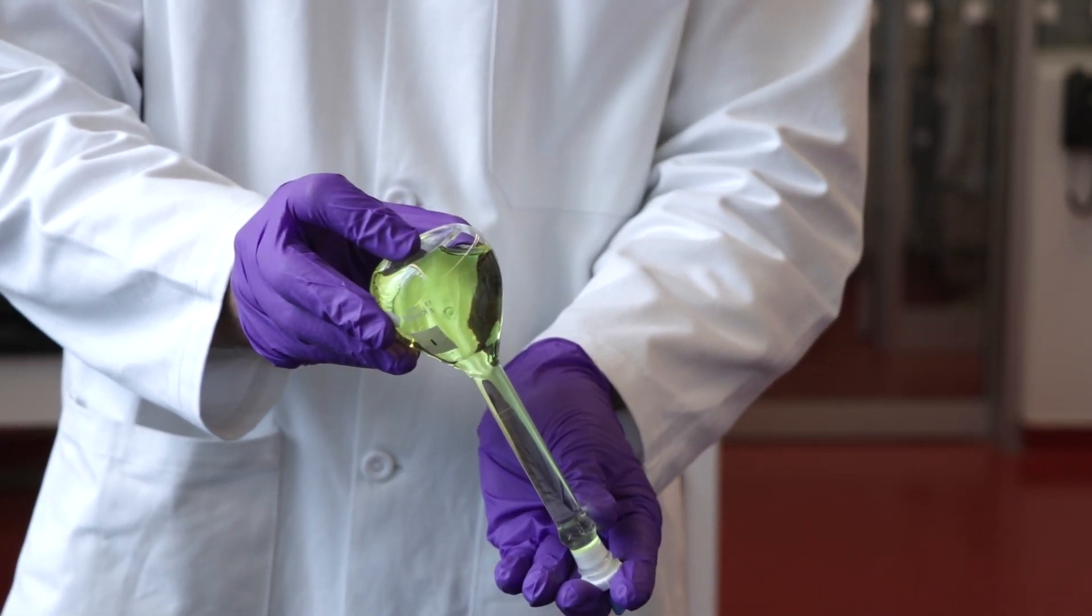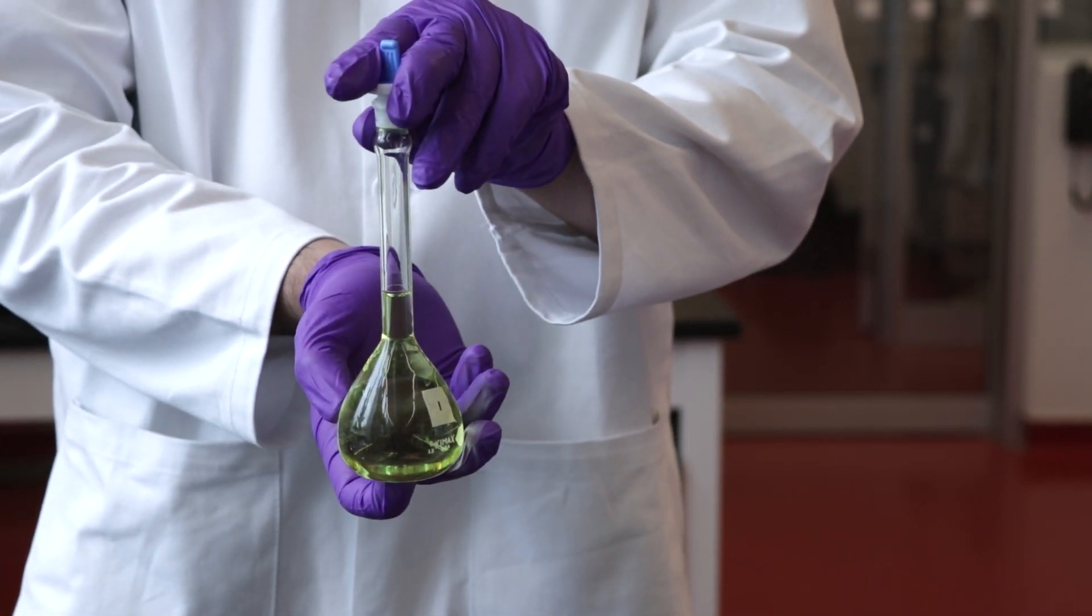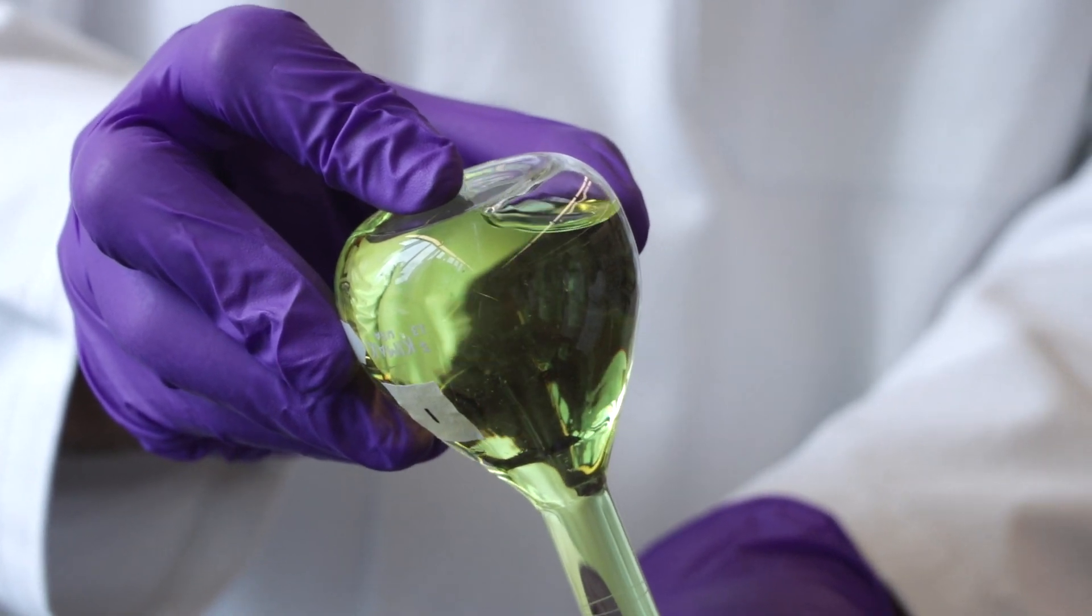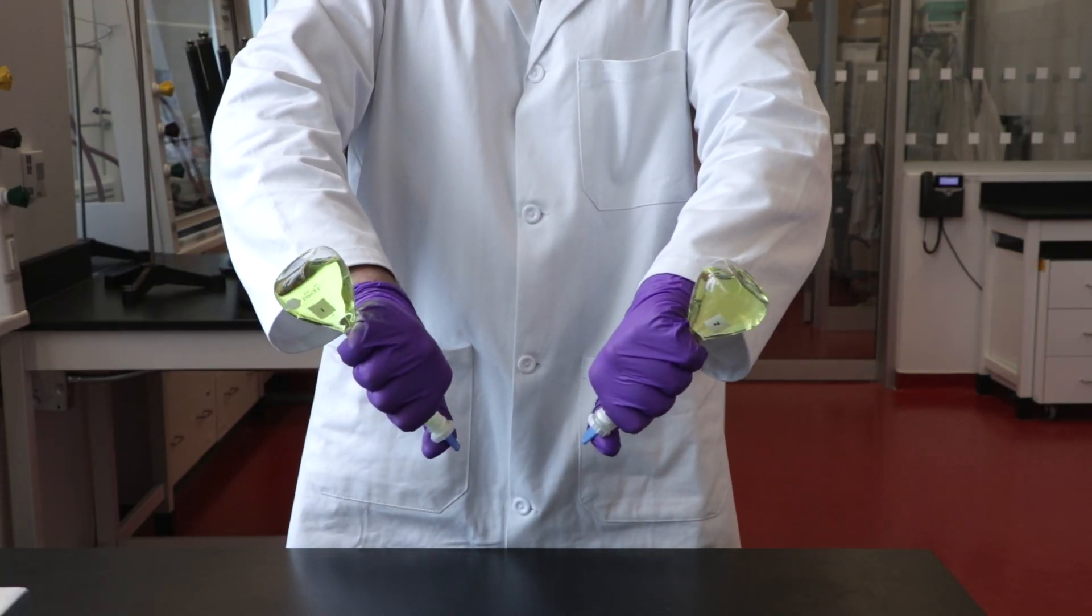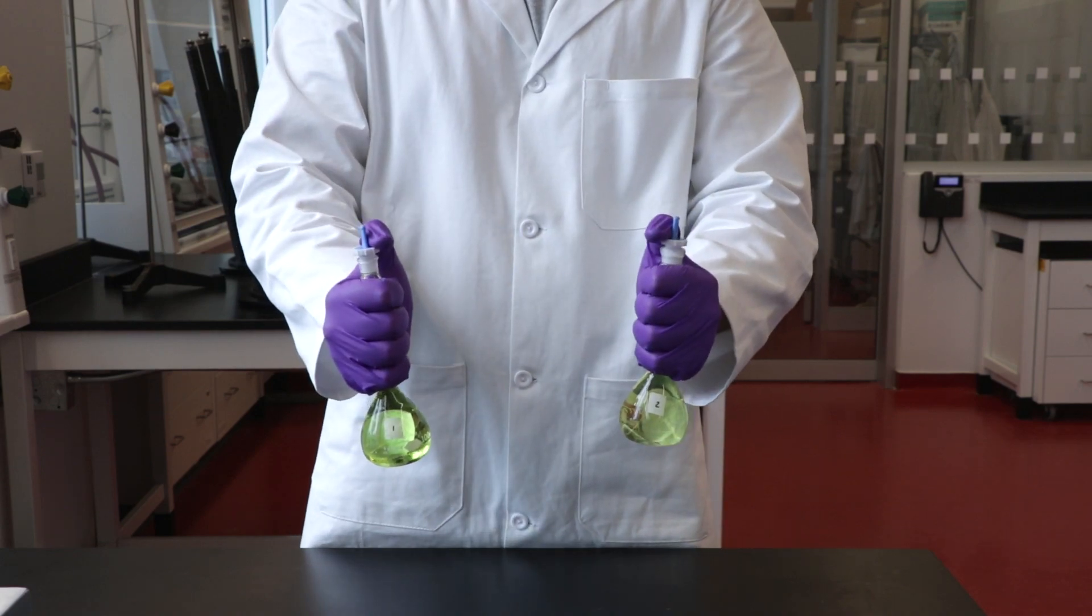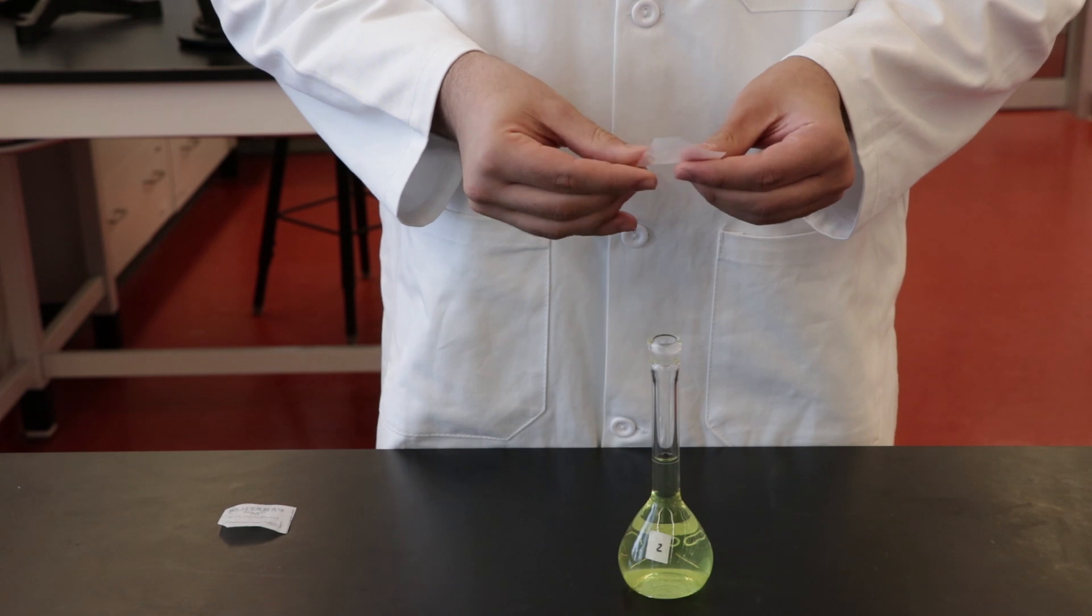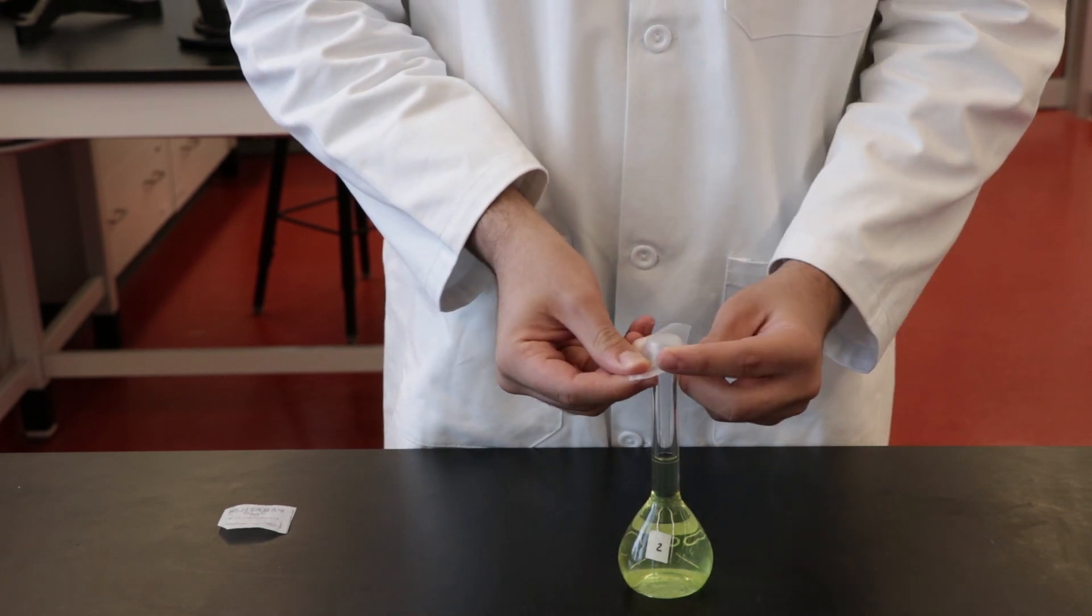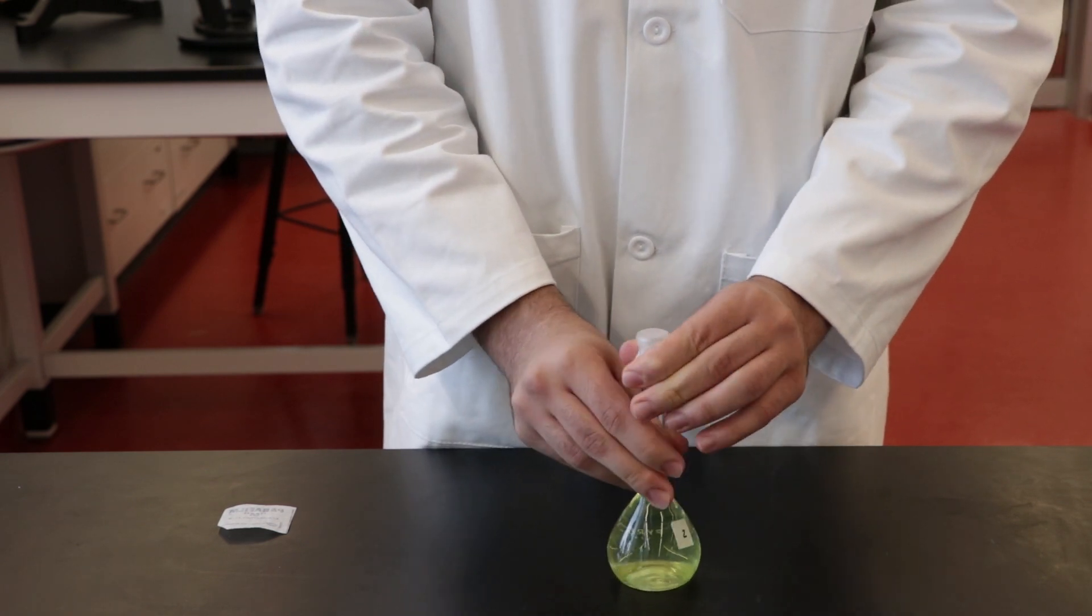You can either take one flask at a time and place one hand on the bottom and the other over the stopper and invert 20 to 30 times. You should perceive an air bubble moving from the bottom of the flask to the top. Or you could take two flasks, one in each hand. If a stopper is not available, you can use parafilm to cover the top of the volumetric flask. Stretch a piece of parafilm over the top and seal securely before inverting the flask.